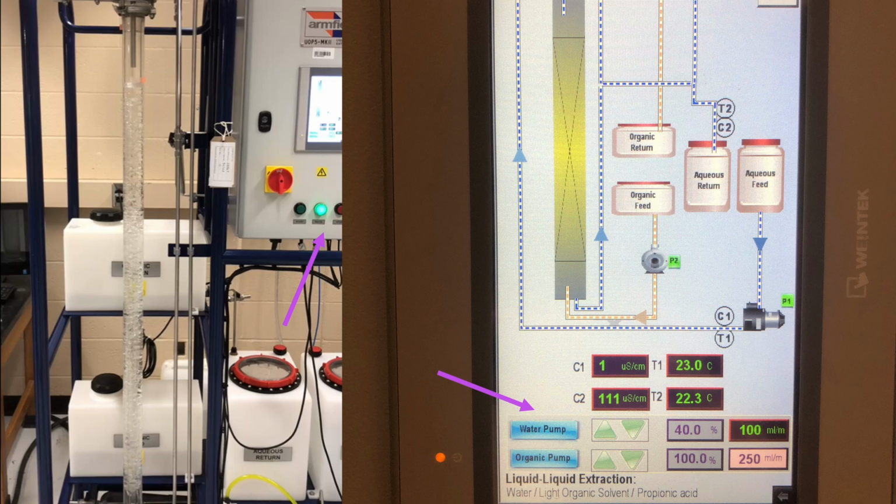Finally, the control panel must be turned off when all the previous procedures are done by pressing the stop button and turning the main power breaker to the off position.